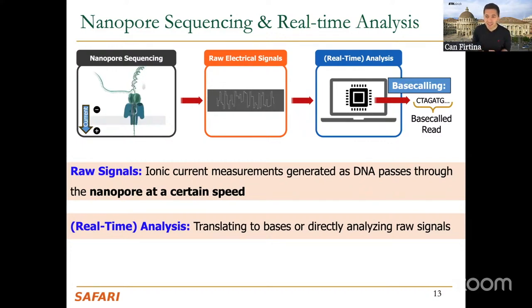So you will start ejecting this read from the nanopore, and since it won't have the necessary adapters, the motor proteins, and so on, it won't necessarily attach again to these nanopores. So once you eject it, it is relatively safe to assume that it won't reattach to the nanopores again.